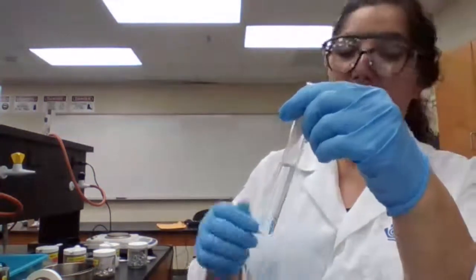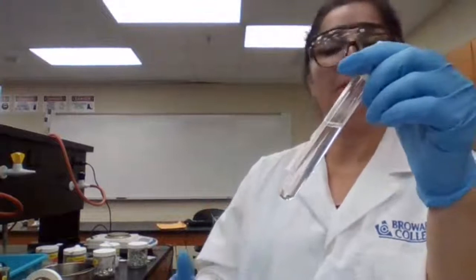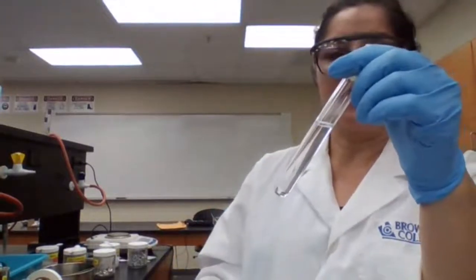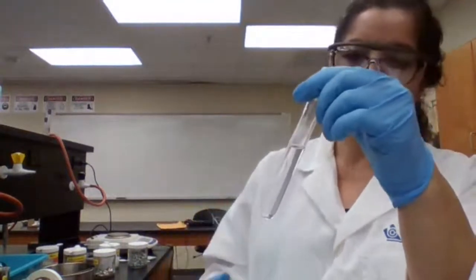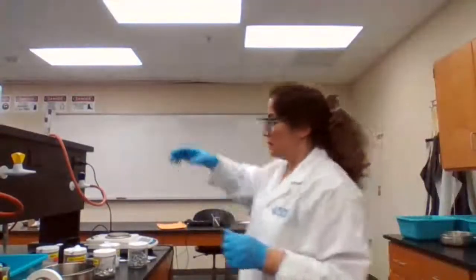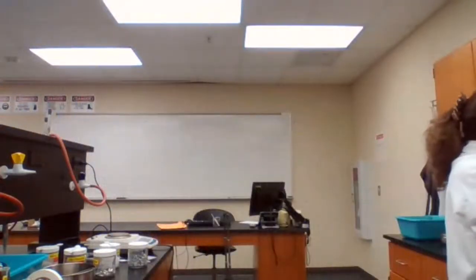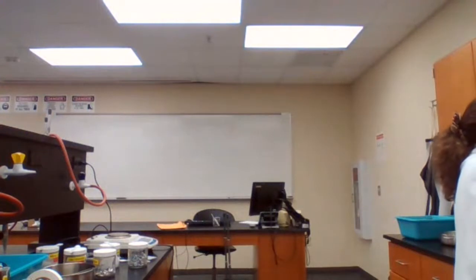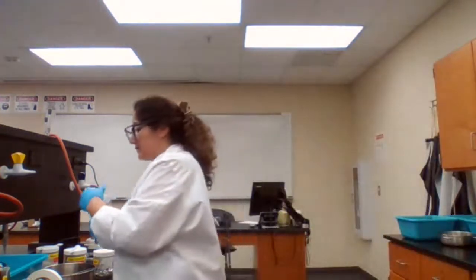Part D of the experiment. It's a long experiment on its own. I didn't expect this to be the problem, but if I don't have any color, I cannot record color change. So it has to show color change to me. It shouldn't take too long if I get the permanganate in my hand fast. I can probably do it quickly, but I have to get the permanganate first.